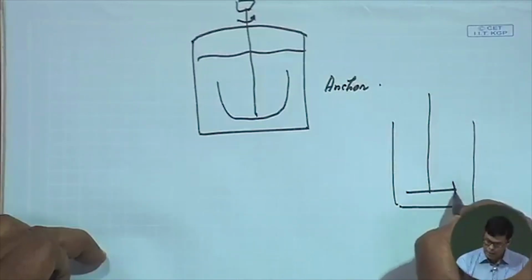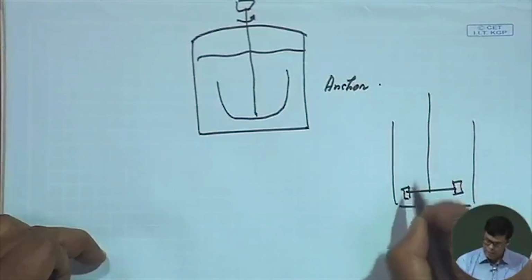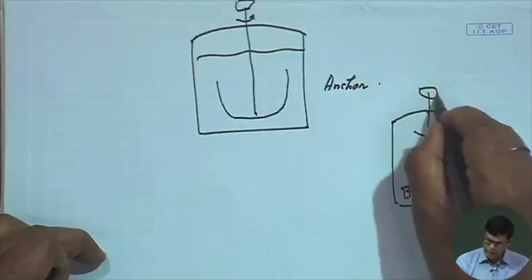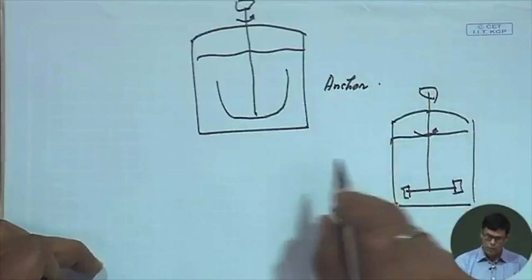The impeller is like this, which has high shear forces.